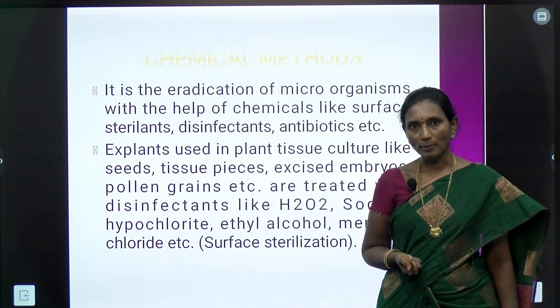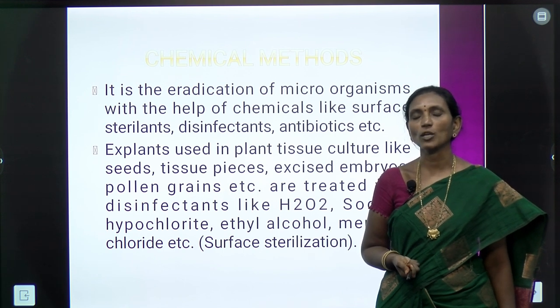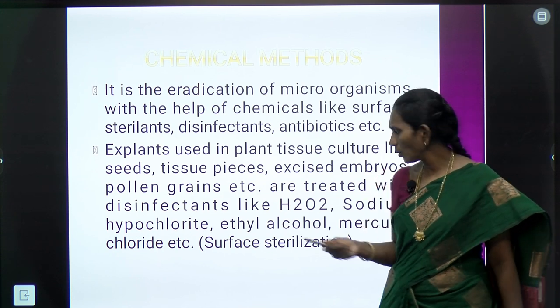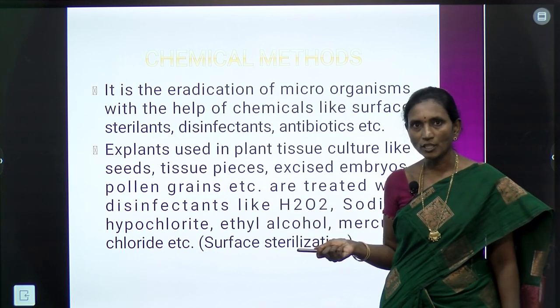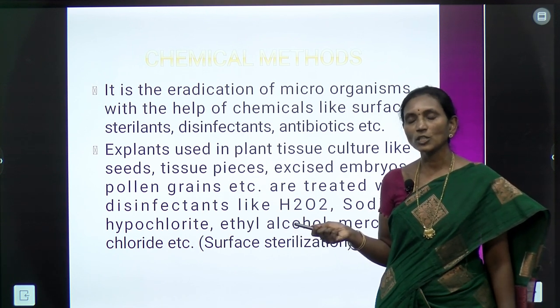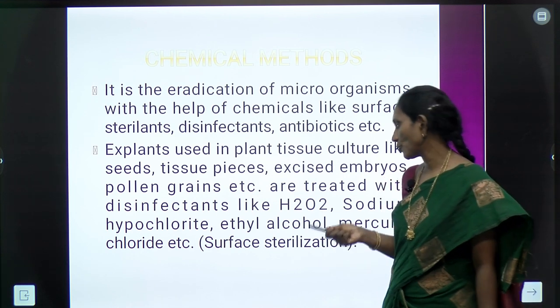After treating with chemicals, we have to wash the explant with distilled water 3 or 4 times so that the chemical will be removed from that explant. So, after chemical sterilization, we have to compulsorily wash the explant with distilled water 3 to 4 times. There must be a provision for a distilled water plant in the tissue culture room also. We have to use only distilled water in the tissue culture technique.